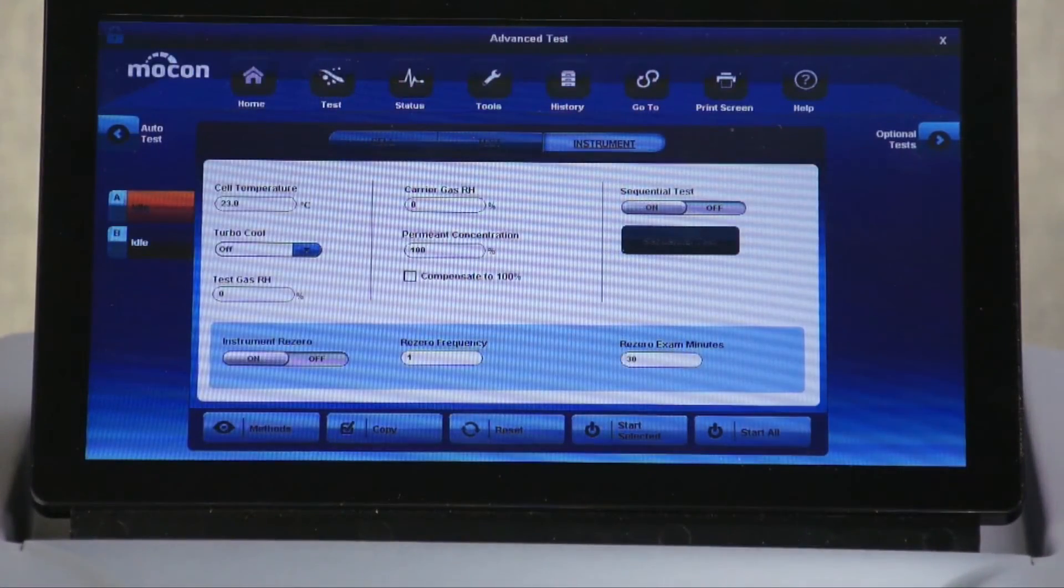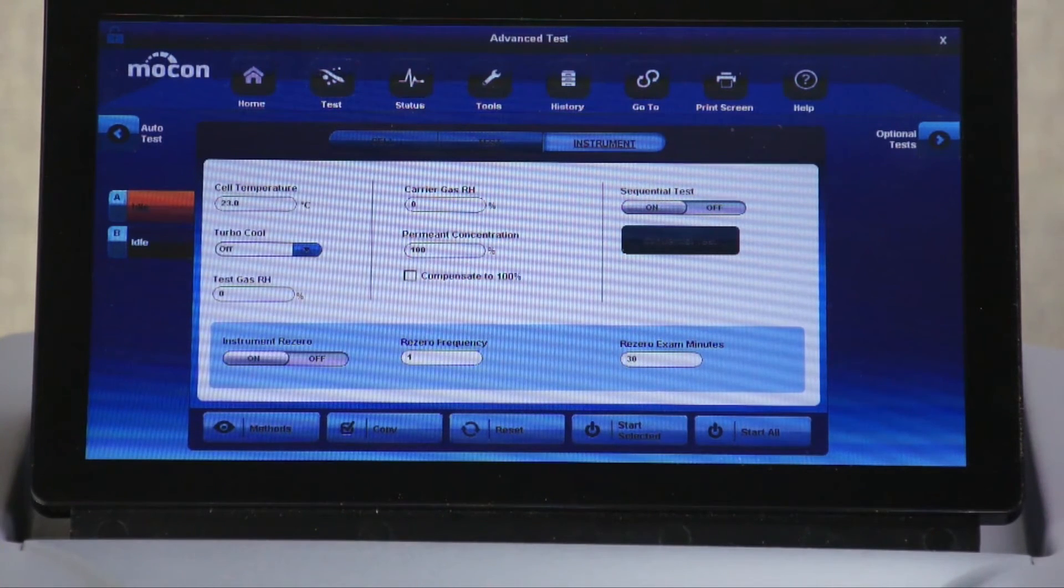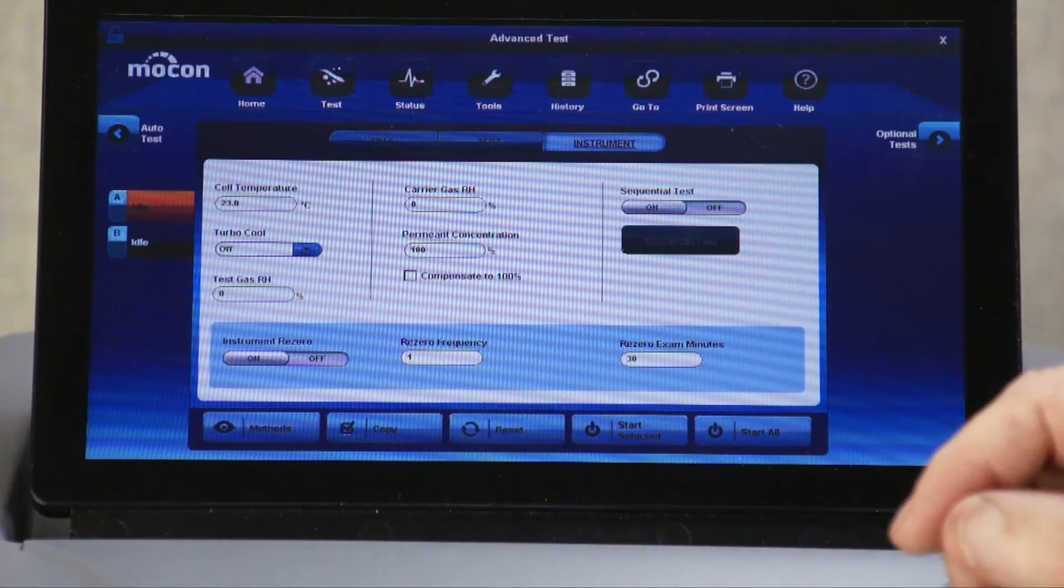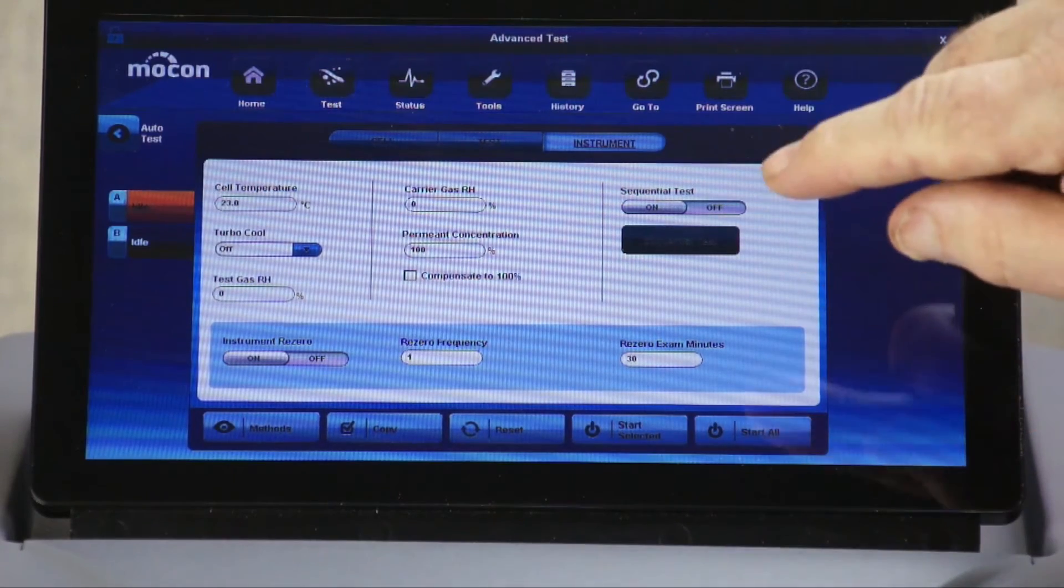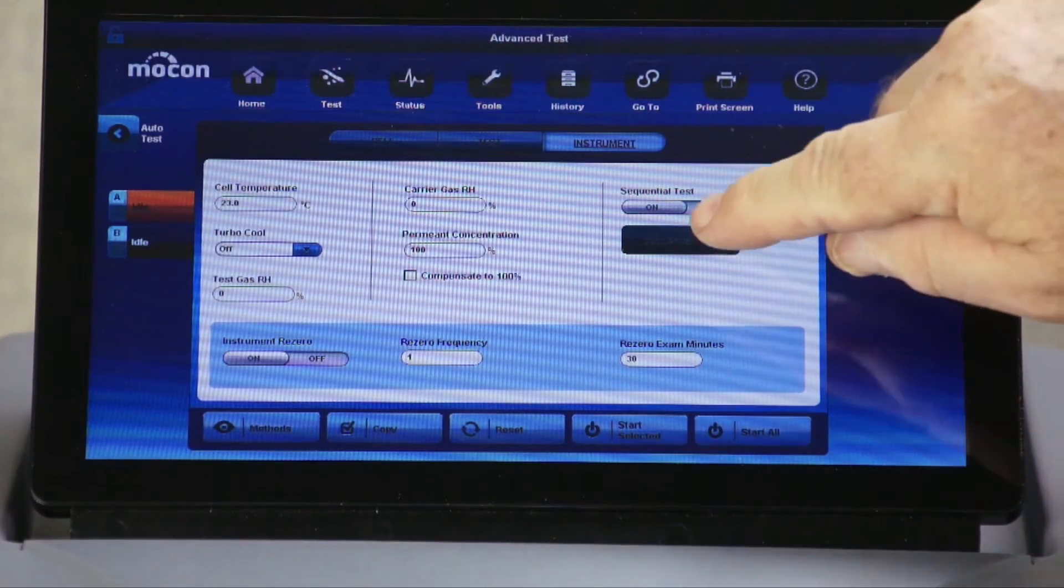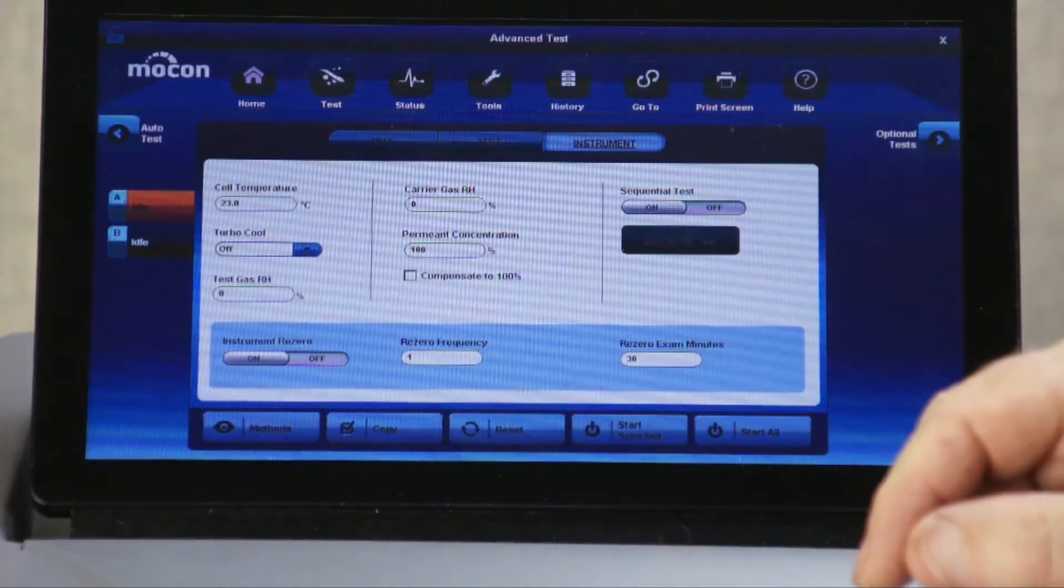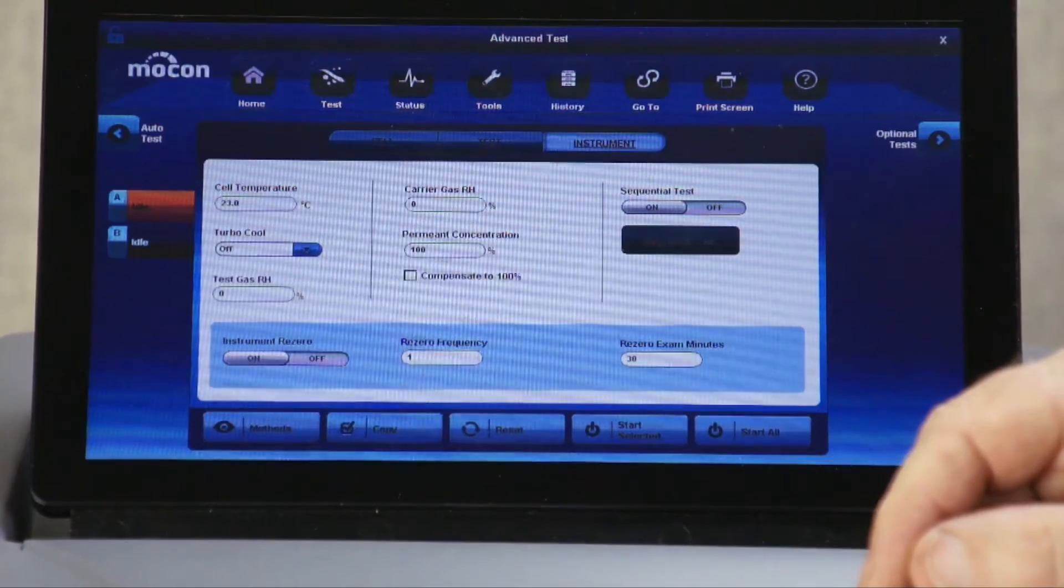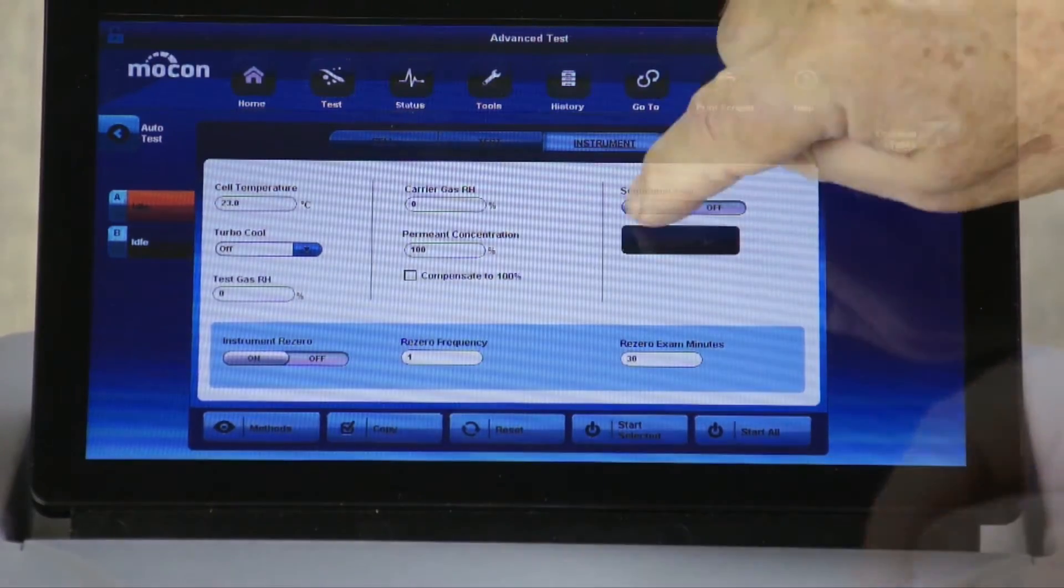Sequential testing means you can, with one setup, get a complete film profile by testing up to 10 different relative humidity and temperature parameters on a single film. This is a huge time saver over setting up each new test.